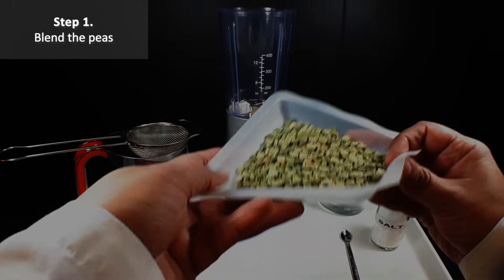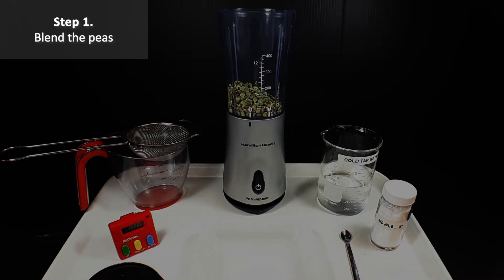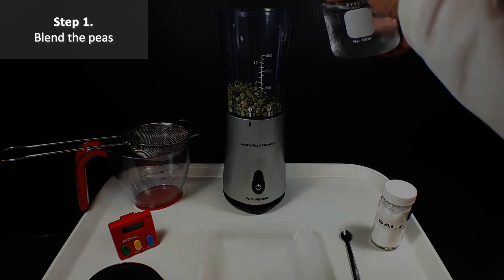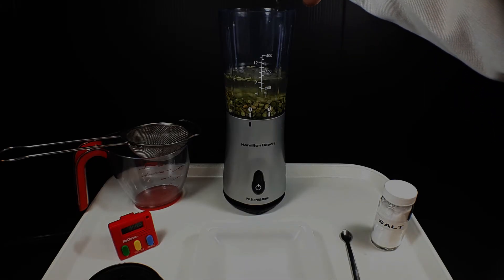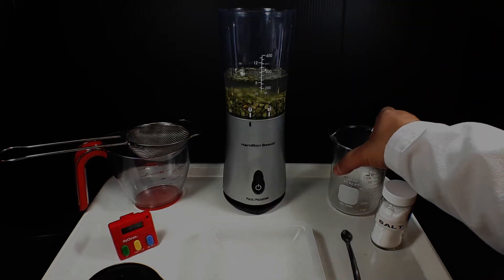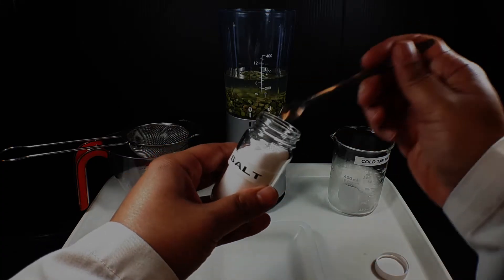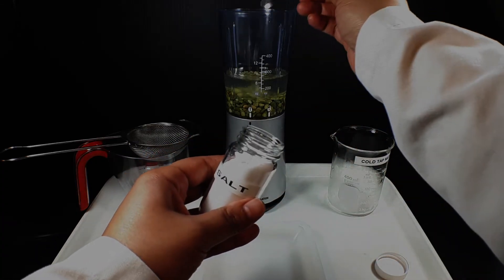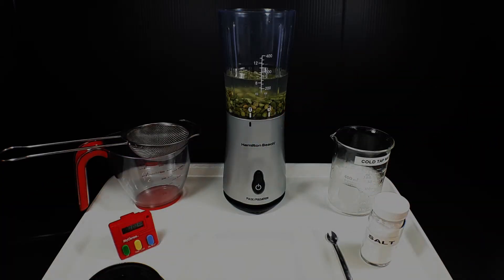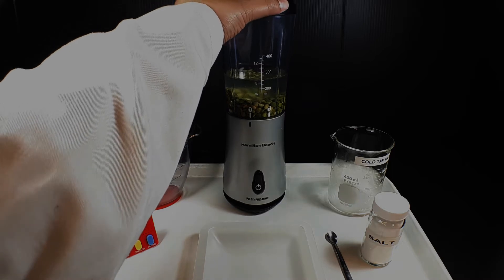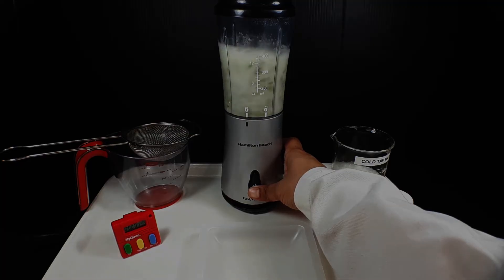The first step is to break down the cell walls of the split peas. This is accomplished by blending 100 grams of dried split peas with 200 milliliters of cold tap water. At this point we also add 0.6 milliliters of table salt. The sodium ions in the solution will help when we precipitate the DNA later in the protocol. Once everything is added and the lid is secure, blend for exactly 15 seconds.